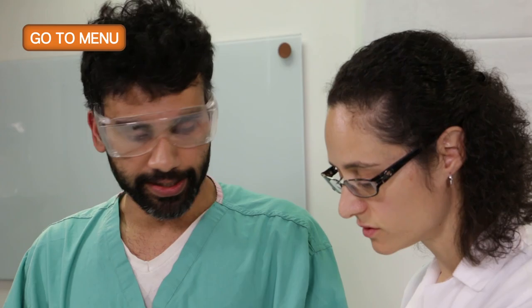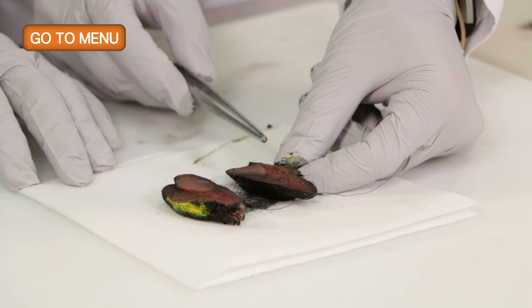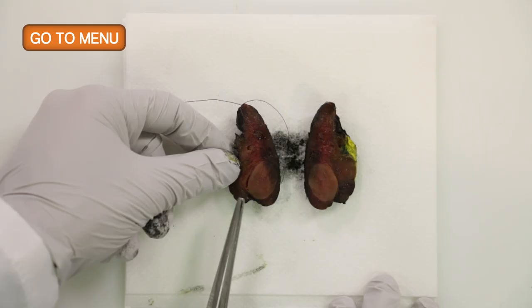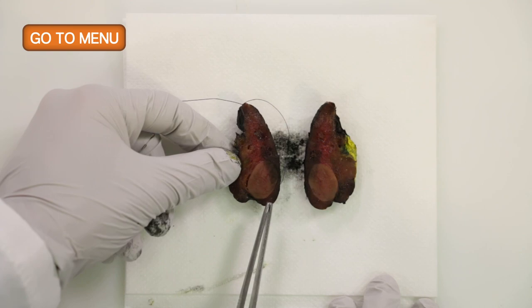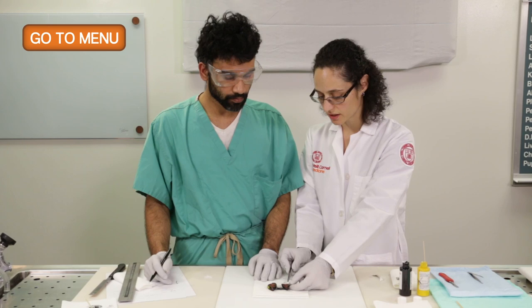Right, so that's exactly what you need to do: identify the nodule and describe its gross characteristics. So it's a single solitary nodule, it's well circumscribed, it's homogeneous. It is an excellent description. It does not have any, at least grossly, malignant features, so it's not invasive looking, and it does not have necrosis or hemorrhage associated with it.